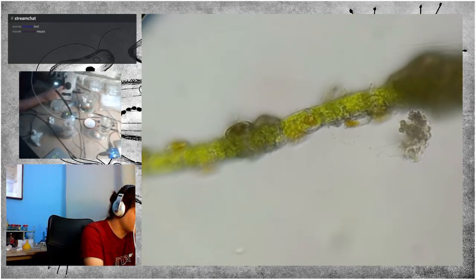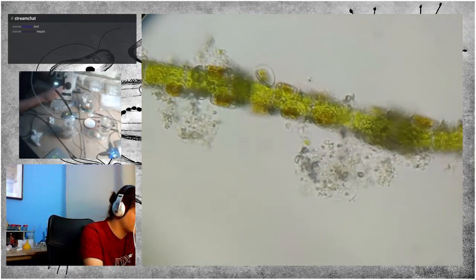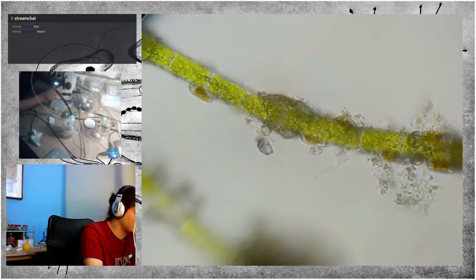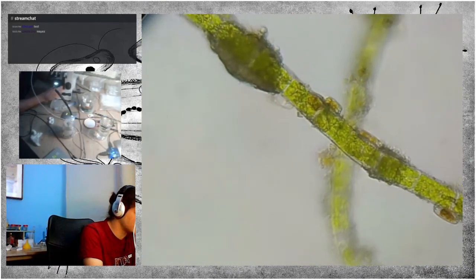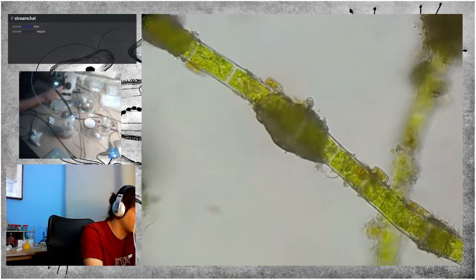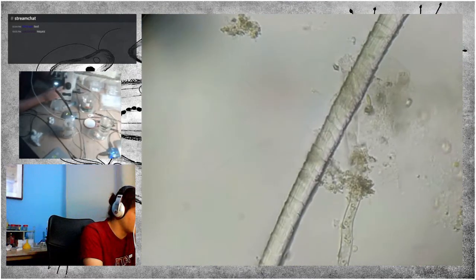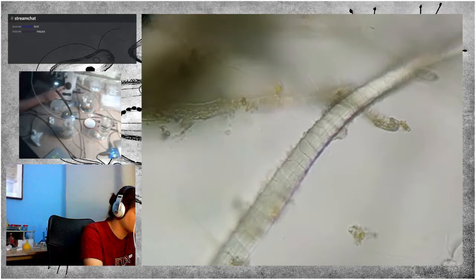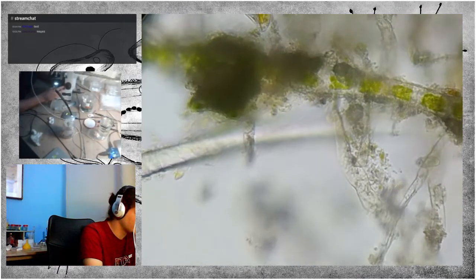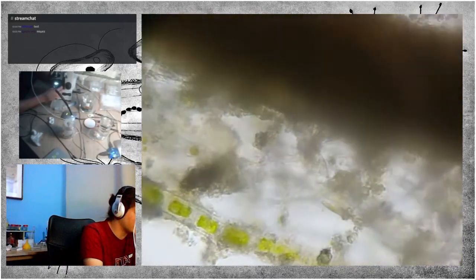They're attached to the algae, which probably helps them get more light, because generally algae can grow higher than the diatoms, which then get to the surface of the water, and then getting more light, and also more carbon dioxide, which either diffuses into the water or rises from the sediment at the bottom, where there are generally more microbes.